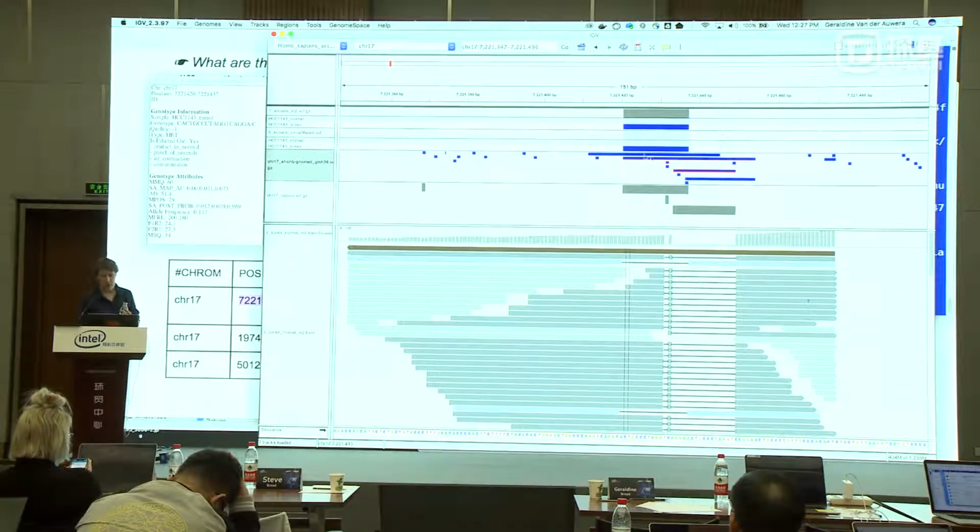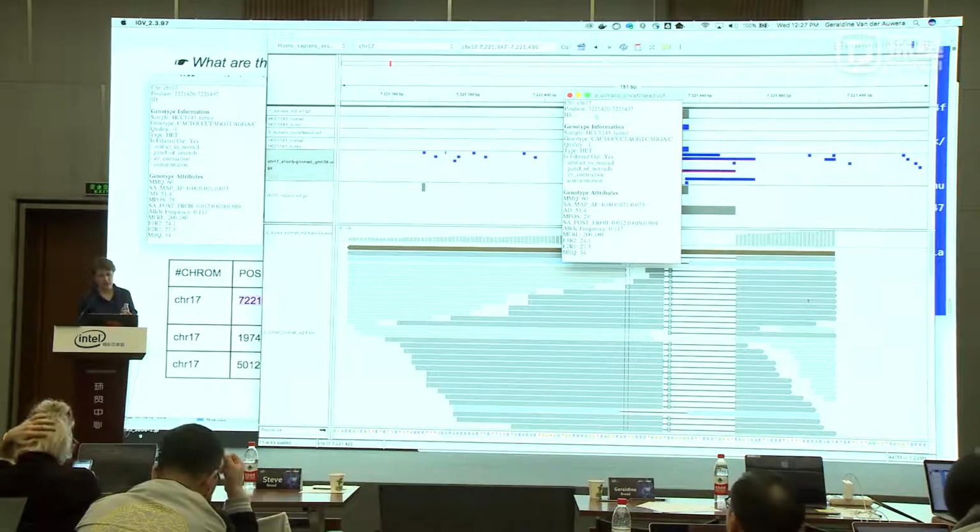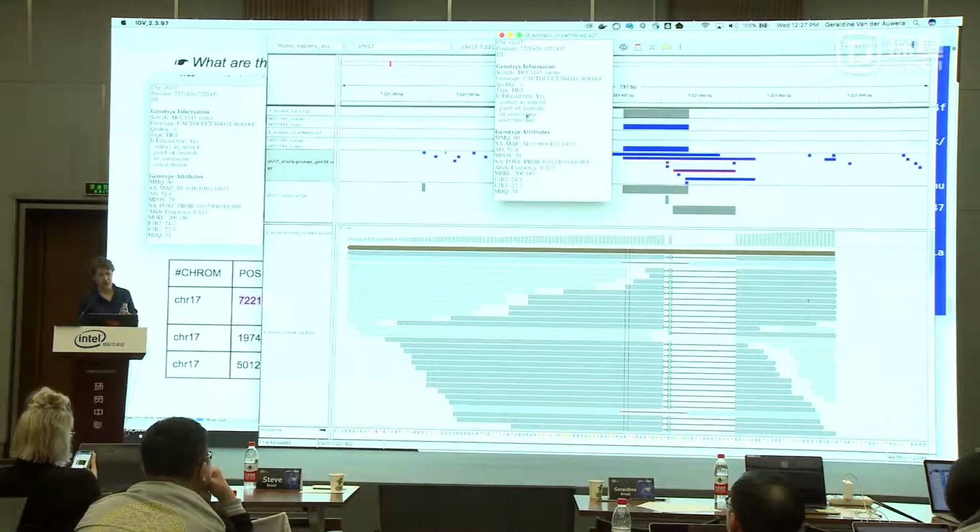And so this is the kind of difficult context that will happen as well, where we are going to filter it out, because if we look at the evidence, this variant is showing up in the panel of normals. That's a red flag. It's showing up in the normal, so it looks like it might be an artifact.